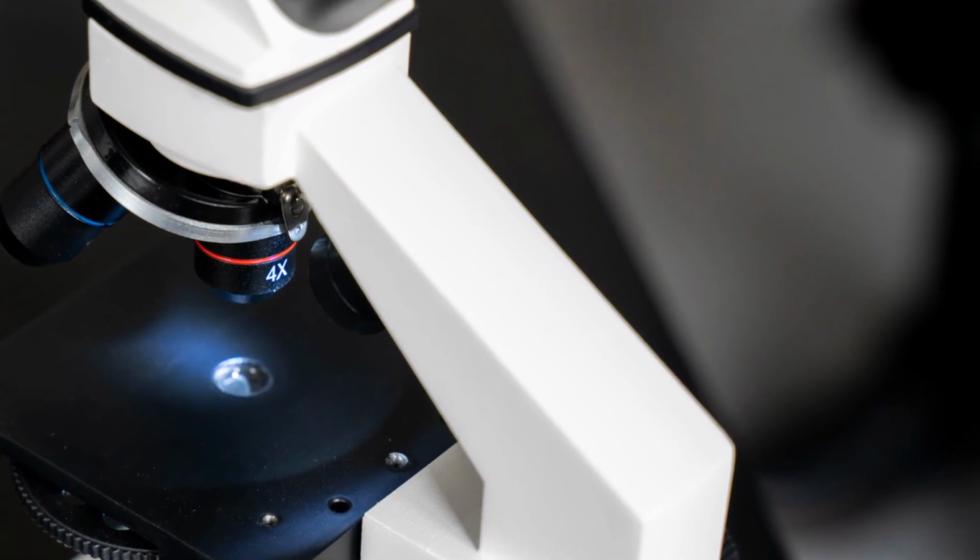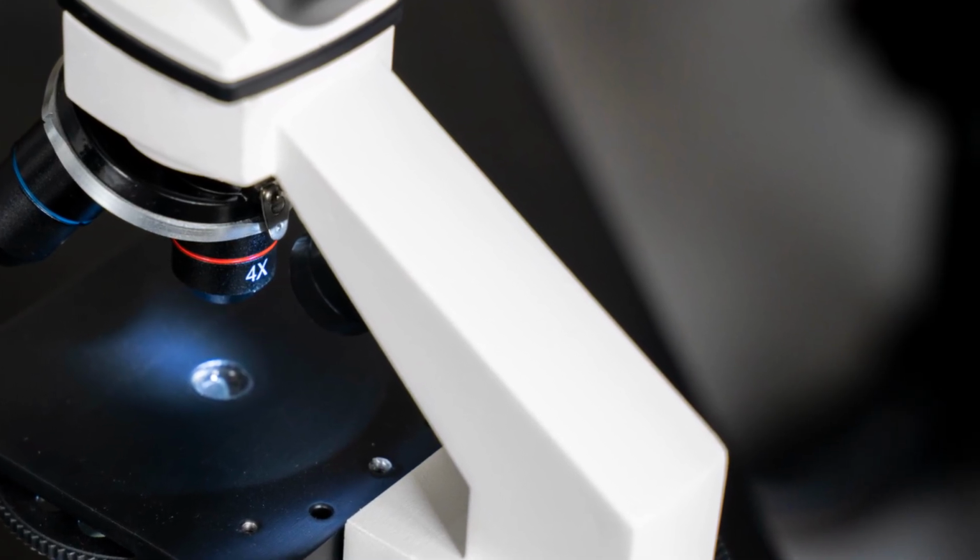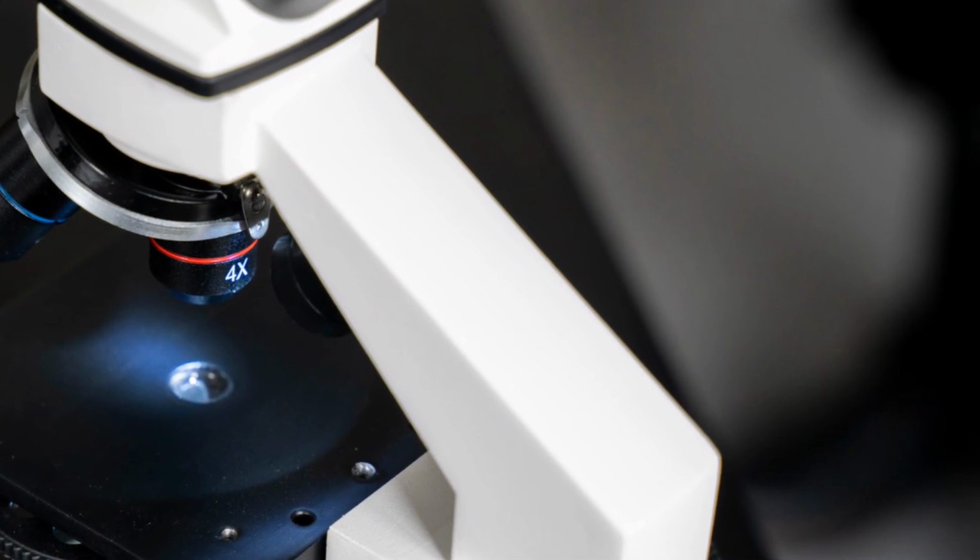There are even attachments that can turn a regular smartphone into a surprisingly powerful microscope. These innovations are putting the power of seeing the unseen into more hands than ever before, democratizing science and enabling new discoveries in classrooms, clinics, and communities around the world. These modern marvels continue to expand our vision, promising even more incredible discoveries to come.